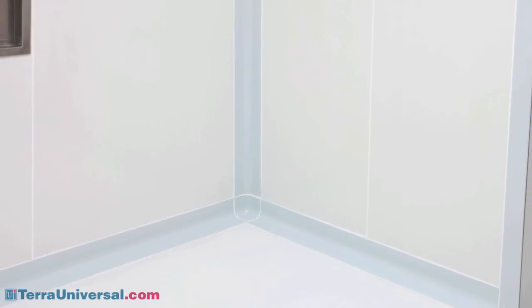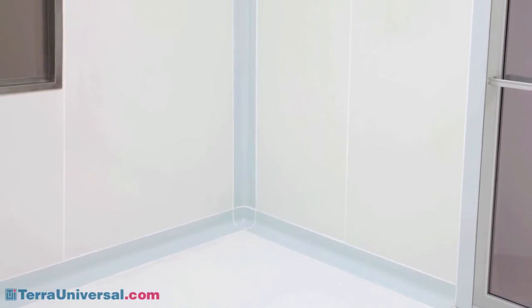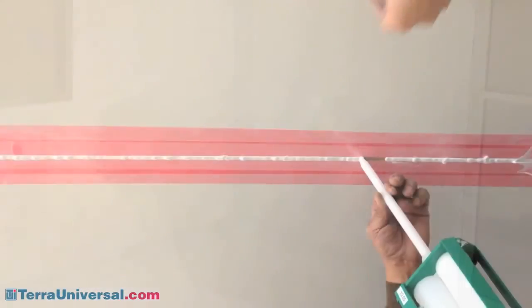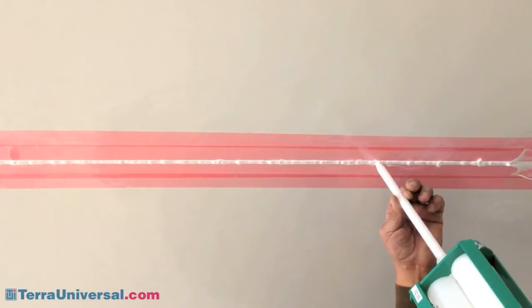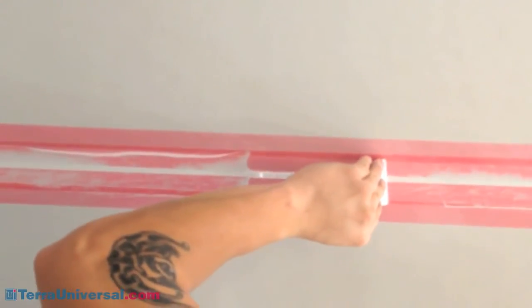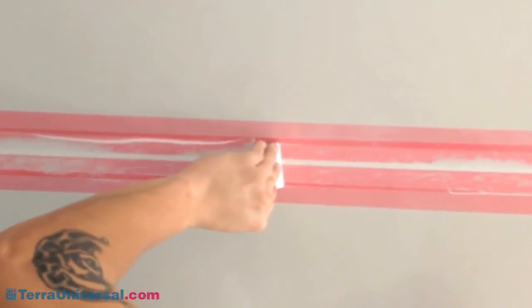In this case, a filler strip is applied to provide a backing for the PVC corner pieces, which are then glued into place, leaving small gaps between corners and wall or floor panels. Finally, seam sealant is applied as shown to fill the gaps and create a continuous seam surface.